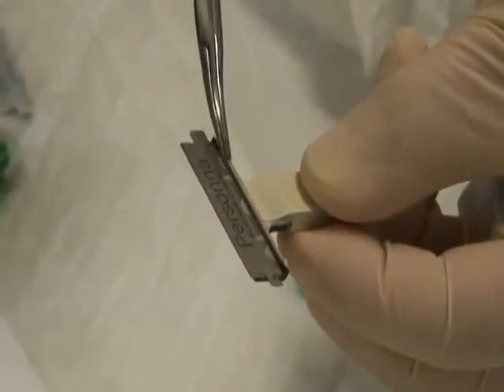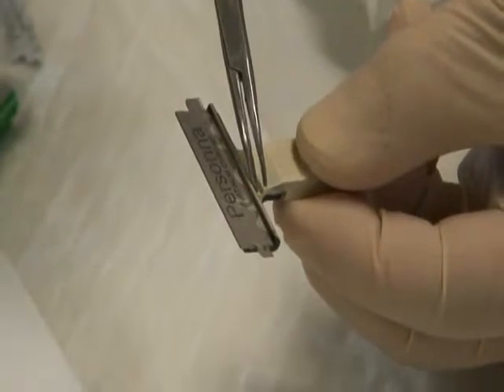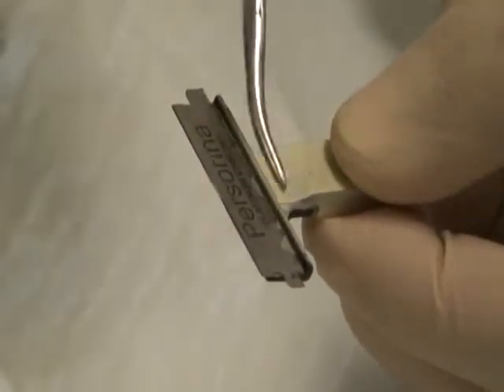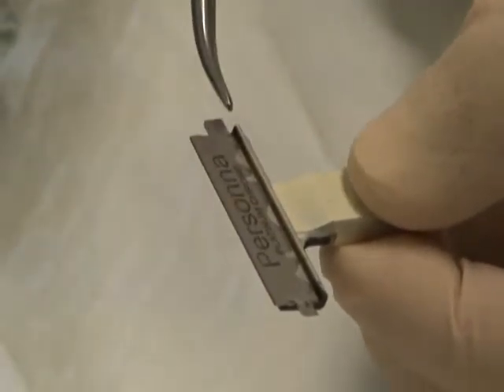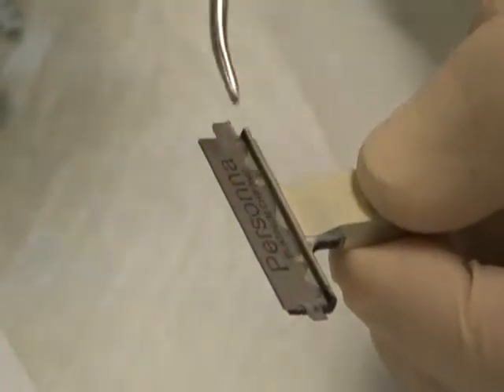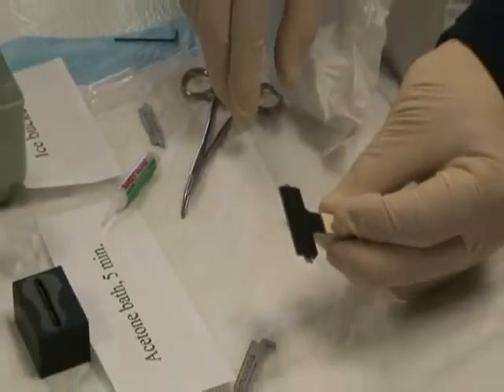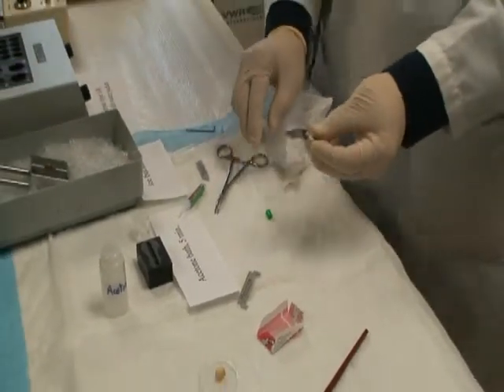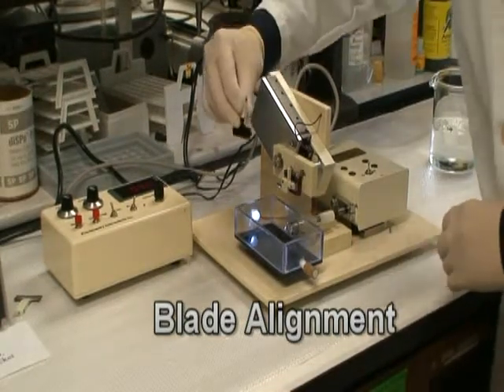The back of the blade should attach to the rib of the blade holder. Both broken ends should tilt up. Blade alignment.